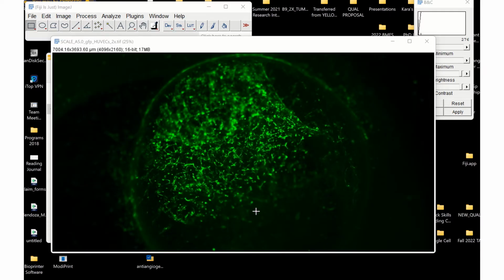So this image is kind of perfect because with WEKA, you don't want a perfect image. You actually want an image that has every type of imperfection that you have in your data set. Now, the reason for that is that you have to teach WEKA what you consider to be actual data, and you have to teach it what is background. So if you already have a really perfect looking image, it's never going to learn how to fix the lesser images.